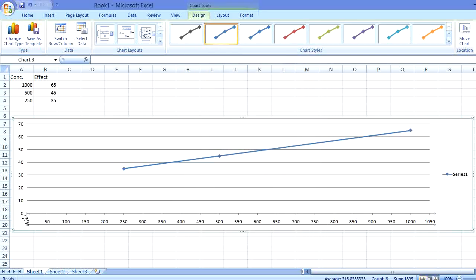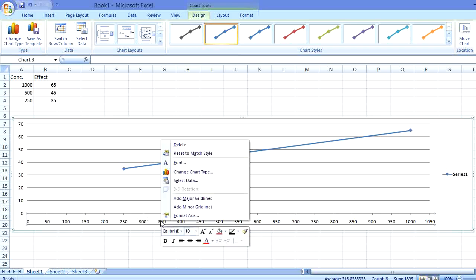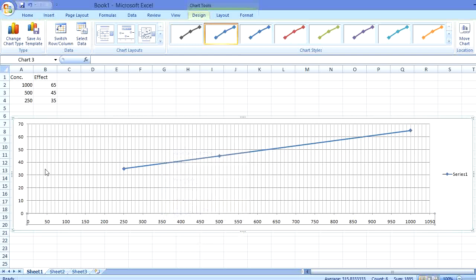Now you can see that we have got a lot of concentrations. We will right-click again and choose Add Minor Grid Lines. We will get a lot of grid lines. These grid lines will help us in selecting the actual concentration which is responsible for 50% activity or 50% toxicity.